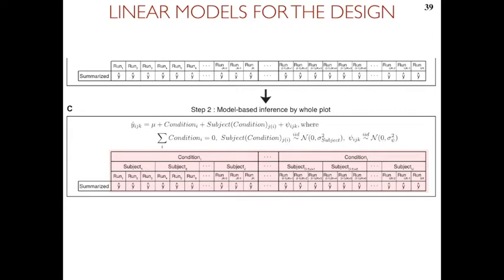And we can build complex comparisons such as, is the difference in exposure to oxygen among low invasive cell lines the same as among high invasive cell lines. So we can have essentially any linear combinations of conditions.